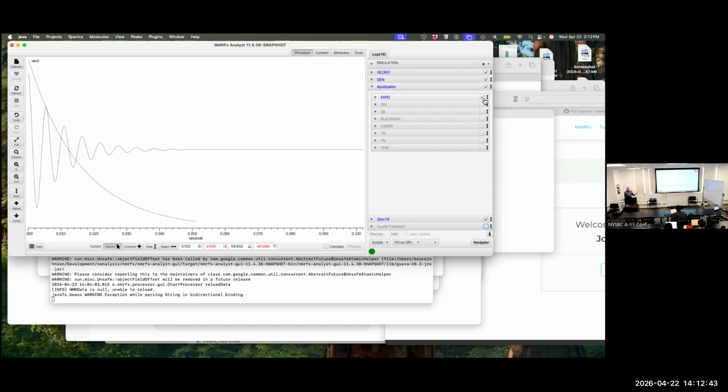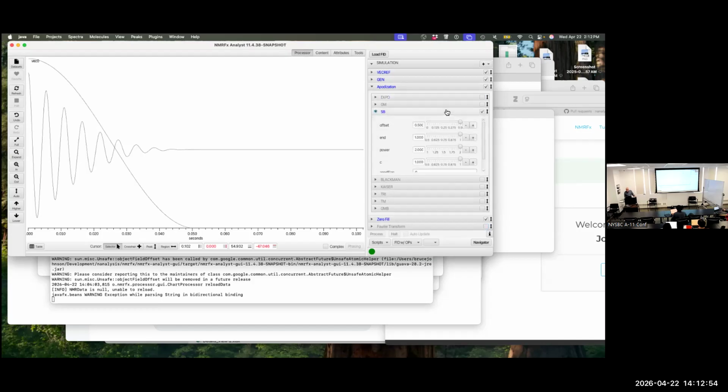So this is playing around with the resolution you have, the signal to noise, and the reduction of these apodization, these sinc wiggle artifacts. The most common function that people use in protein spectroscopy is probably a sine window, and often a sine squared. So you can see under the parameters that I have over here, we have a power, by default two, that gives you a sine squared. You can play around with any of these to see what the shape looks like. 0 and 1, that's a true sine window, that's sine squared.